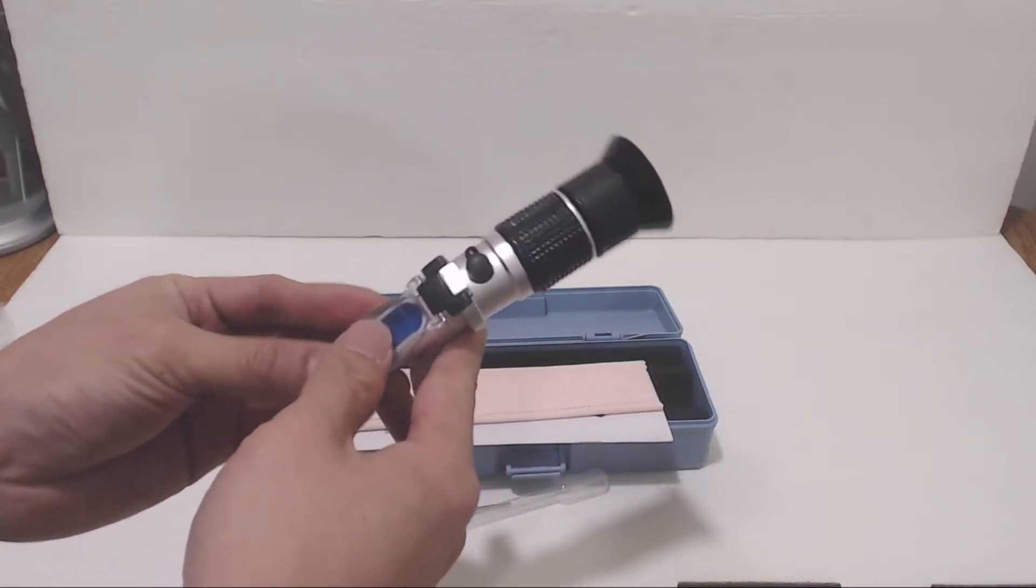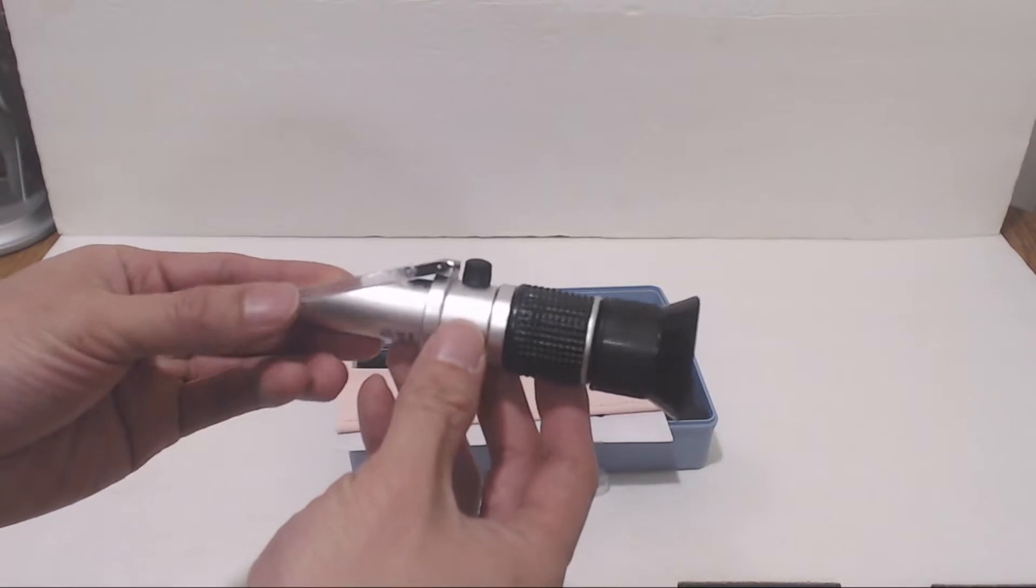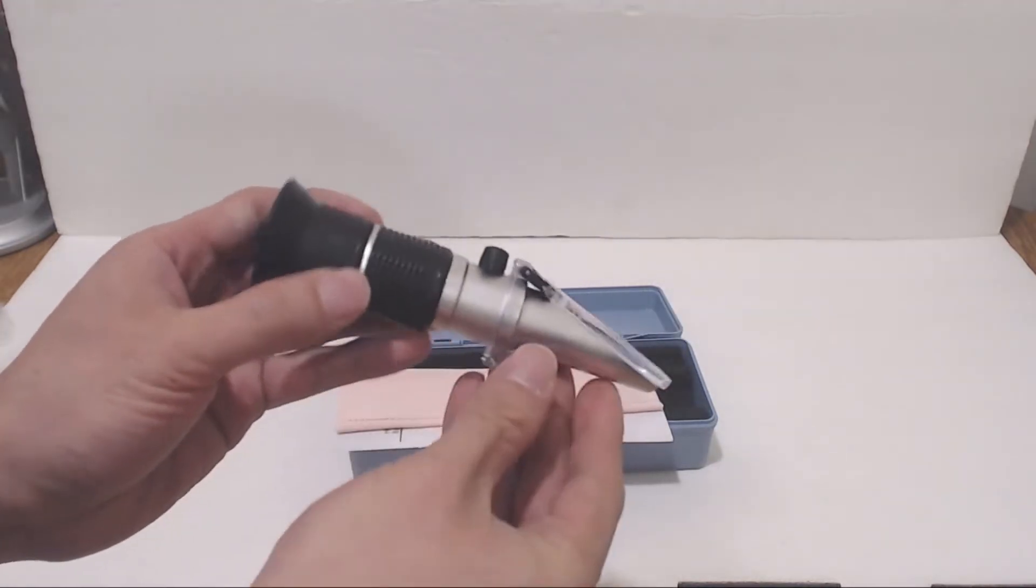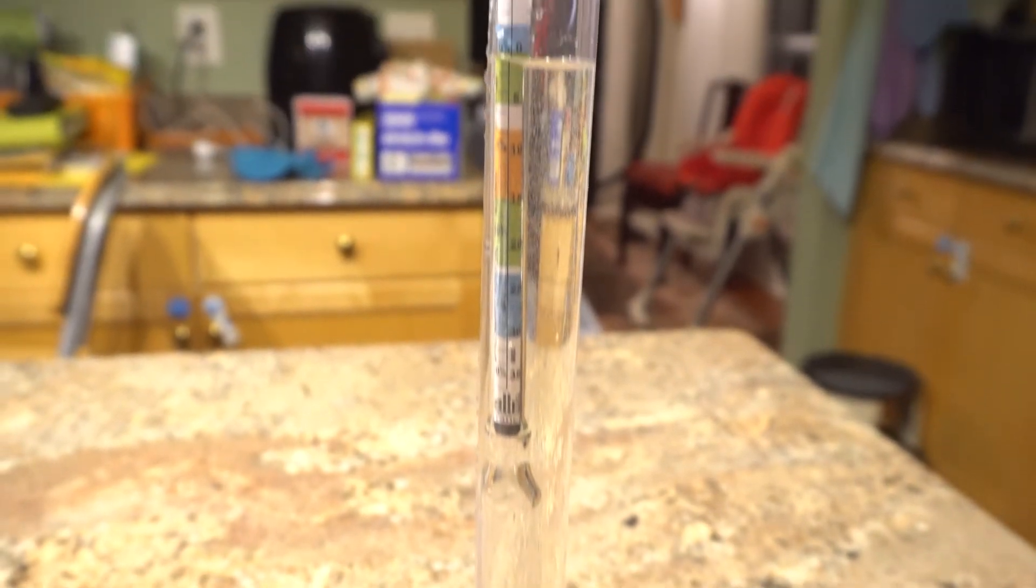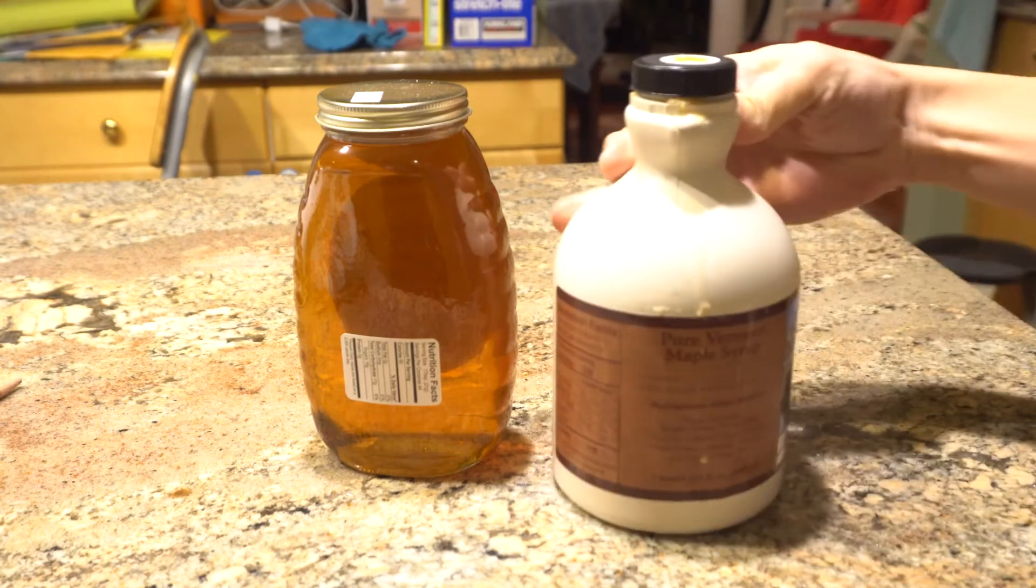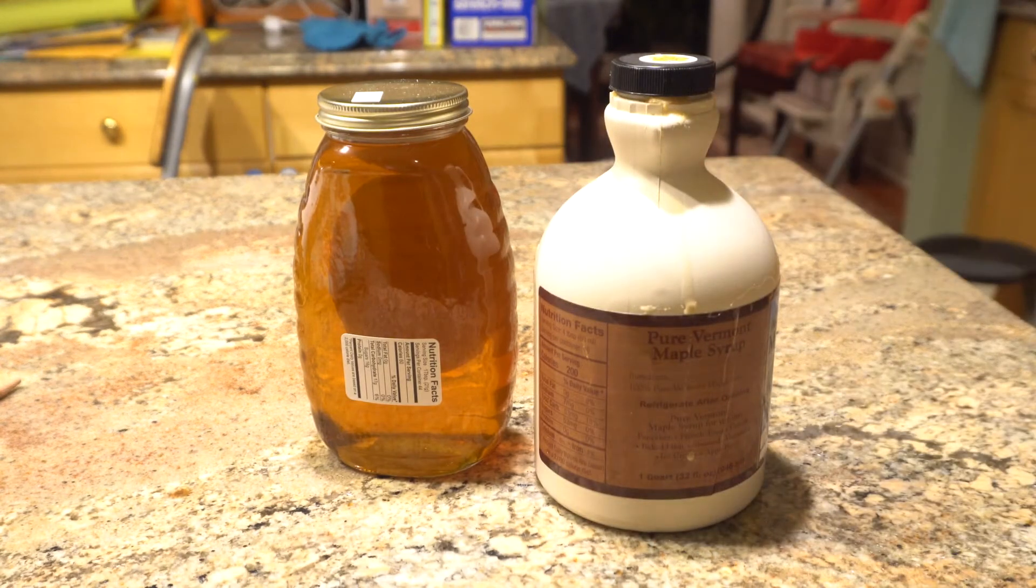This tool is commonly used in wine and beer making to measure sugar content before and after brewing in order to determine alcohol content after fermentation. This takes the place of a hydrometer, which measures specific gravity. With this high-scale refractometer, you can also measure the sugar content of products like honey and syrup.